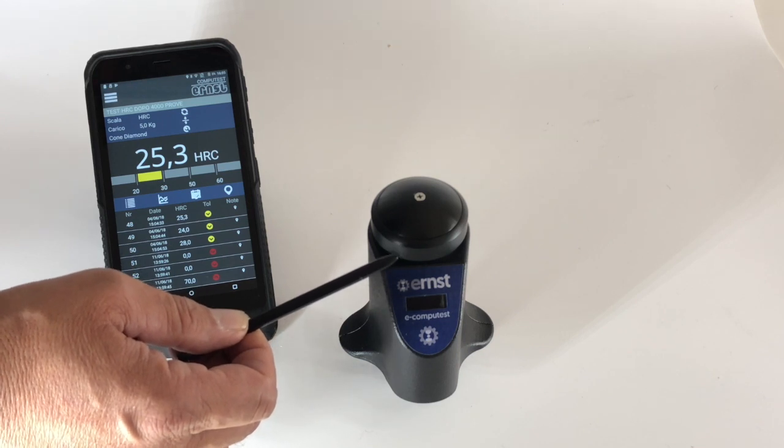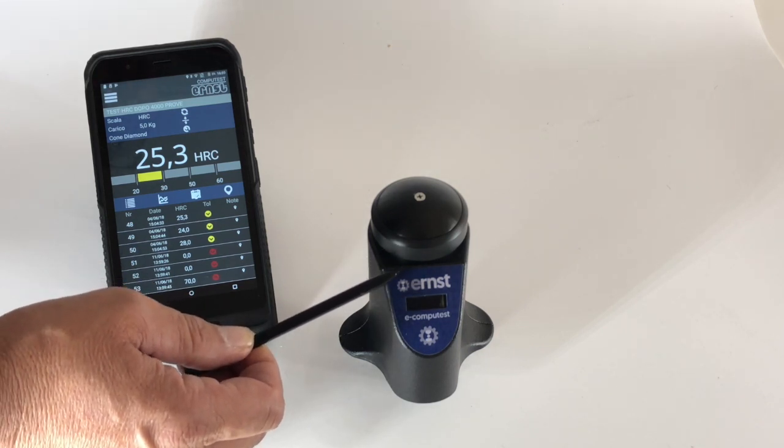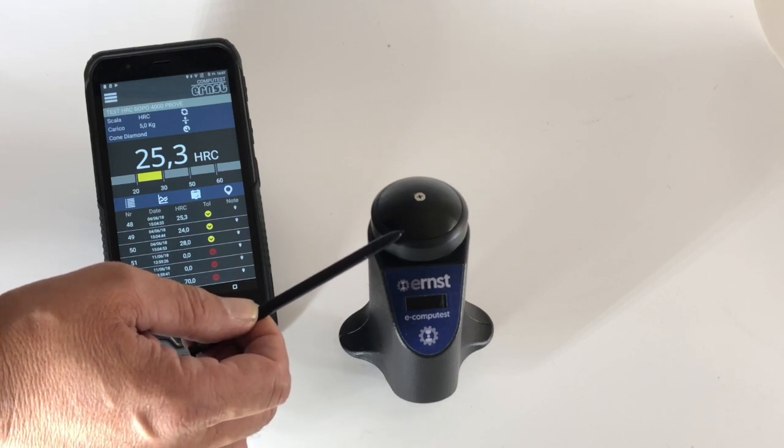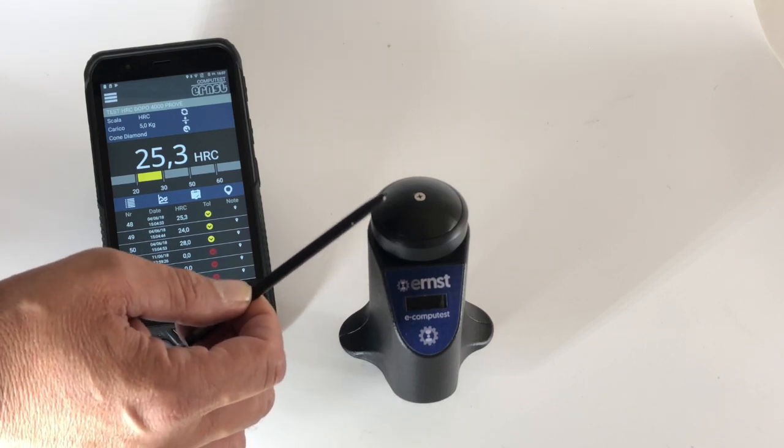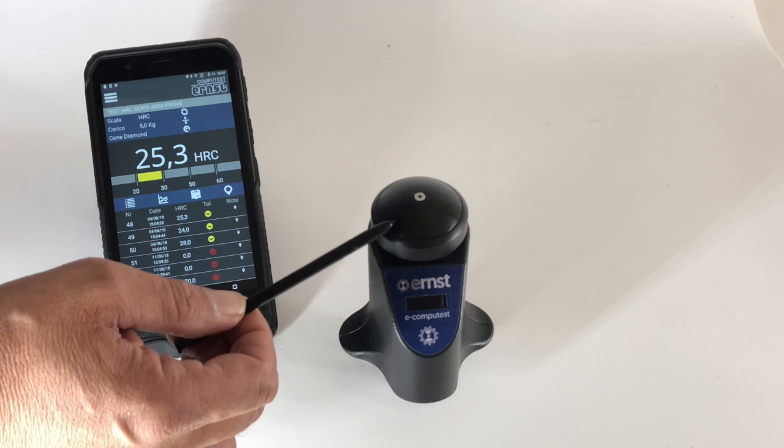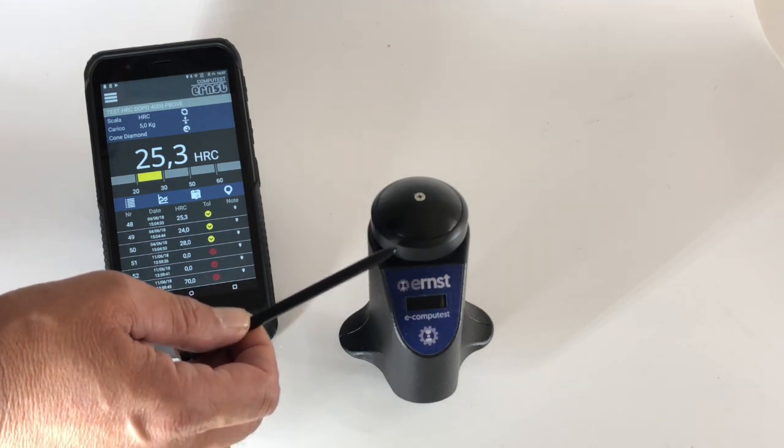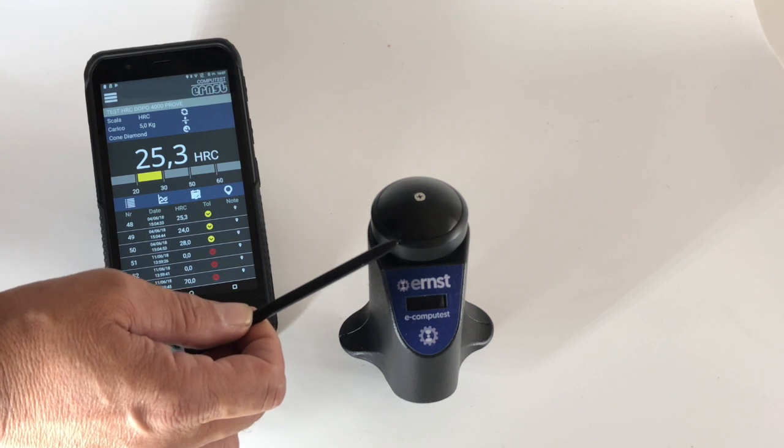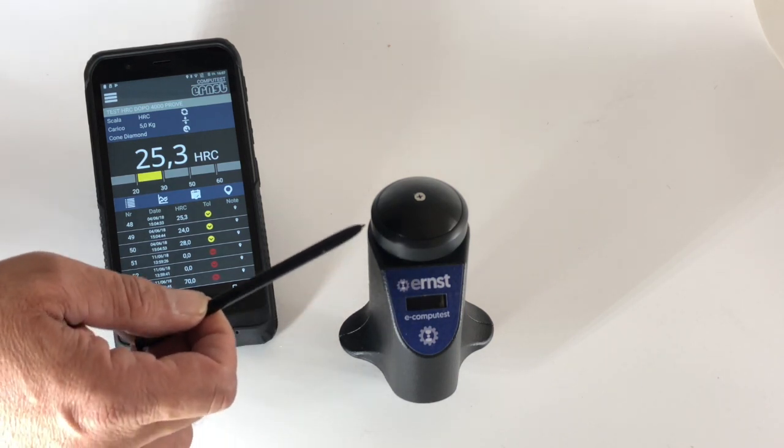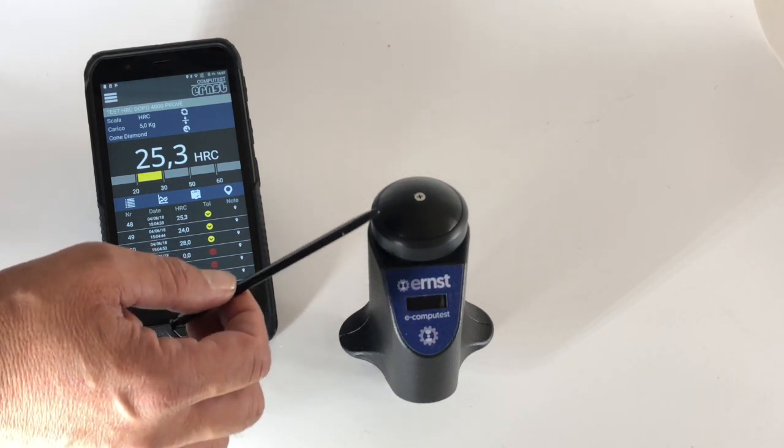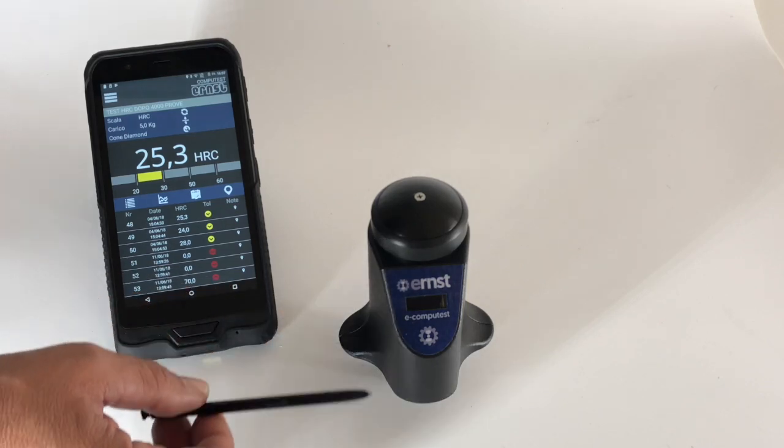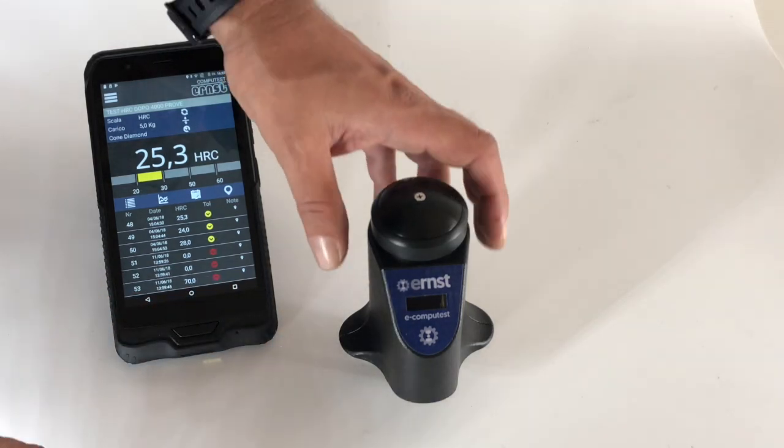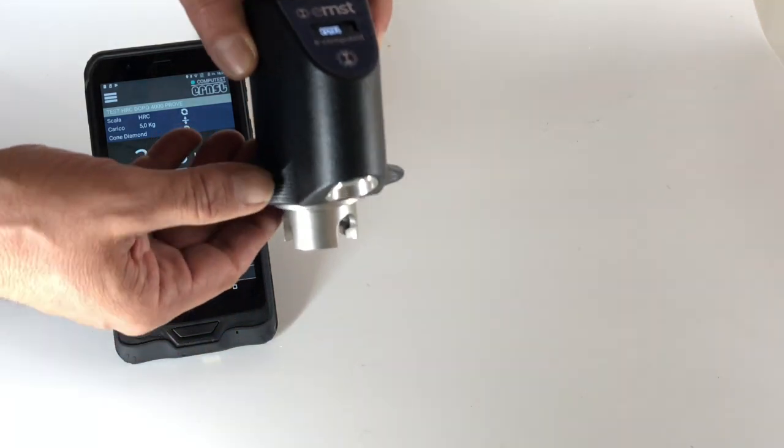Well, this is the main characteristic of the instrument. We shall also consider a couple of things which are very important for a portable unit like this. The first thing is that you can use the instrument and measure in all directions.